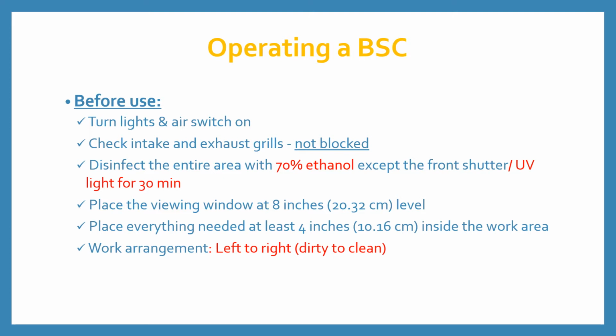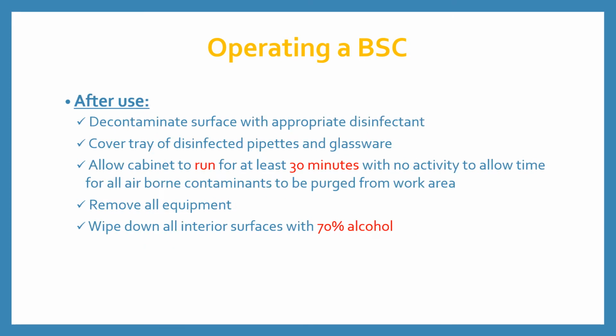Lift the sash or the viewing window and place it at a height of 8 inches. Place everything needed at least 4 inches inside the work area. The work should be arranged from left to right as dirty to clean.